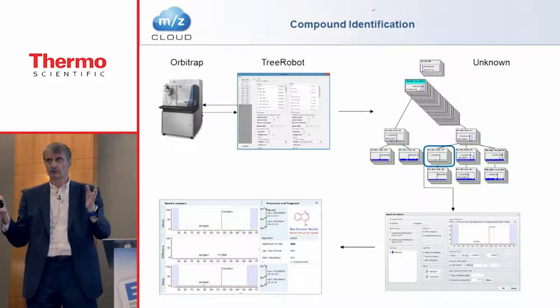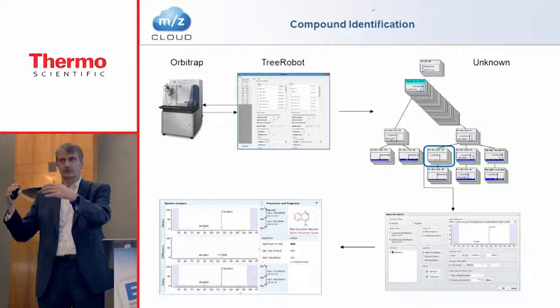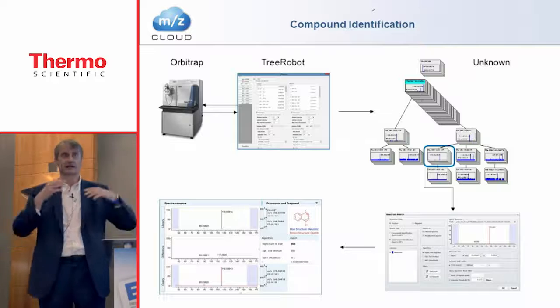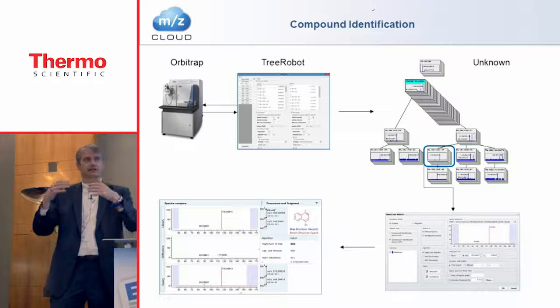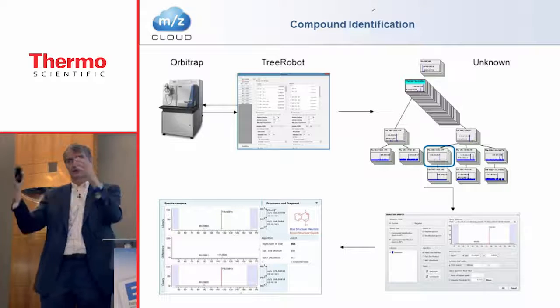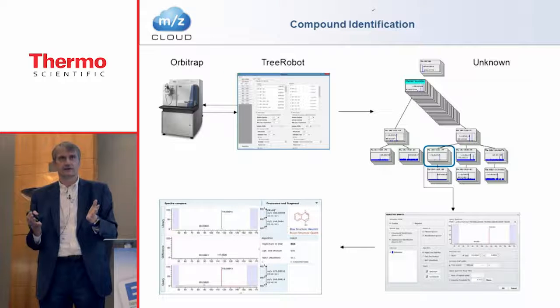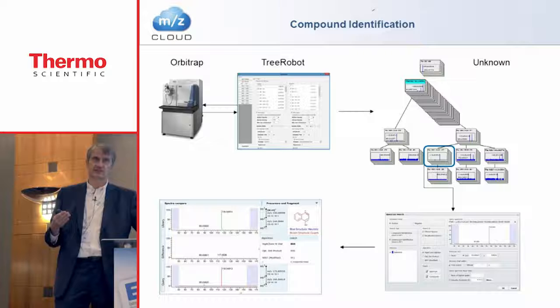Because many of you are working in a relatively limited structural space, you are not dealing with environmental compounds, where you can encounter everything. Therefore, we always recommend building an in-house database of compounds that are actually in your company, because those substructures can later be found in your samples.